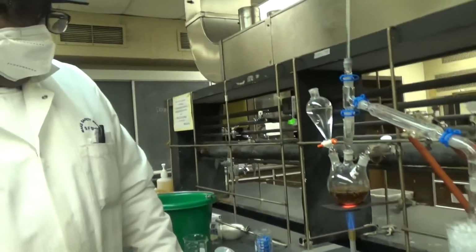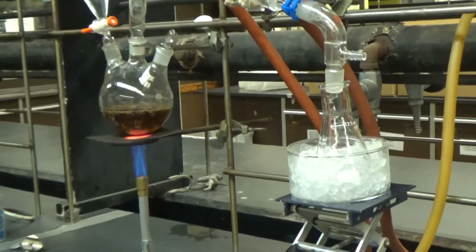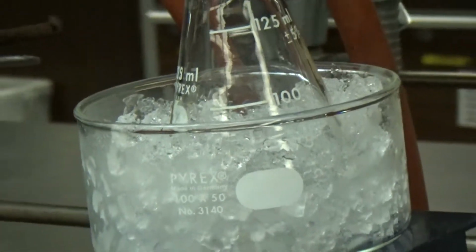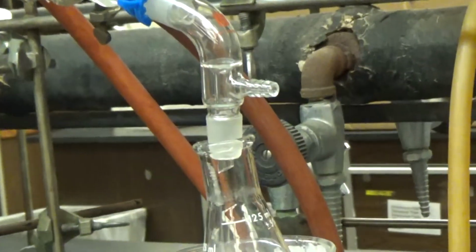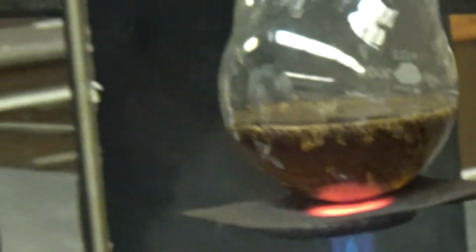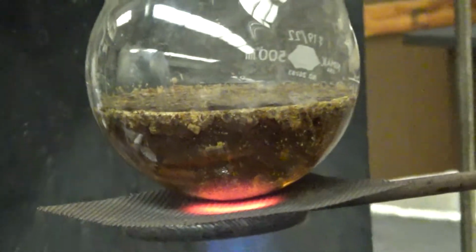Okay, so we're continuing to go forward in the experiment. The one thing we changed is we added an ice bath around the receiving flask, which will keep it cold after it condenses through the condenser and down into the vacuum adapter, just to make sure it's collected nicely. It's still hot and starting to boil, but we need a little more time. There's the cloves at the bottom. We see some bubbles.